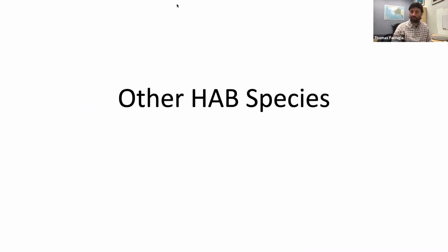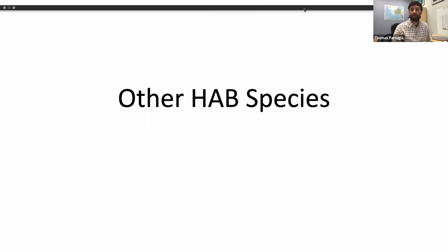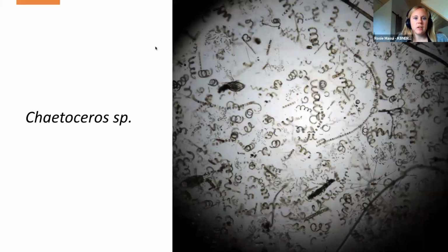Excellent, thank you. That was a great overview of those 4 HABs, but you'll see other things under the microscope, and so Rosie's going to show us a few other ones as well that we might see. Yeah, great. Thanks, Thomas. If you want to hop to the next slide.